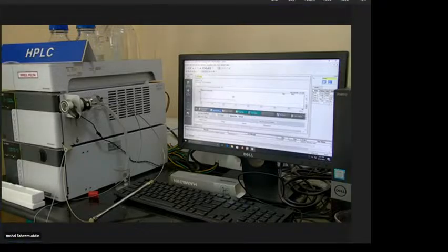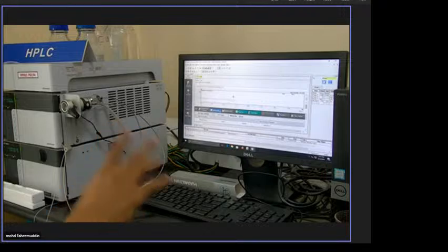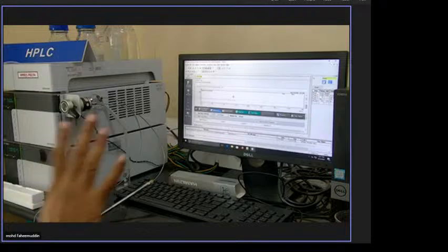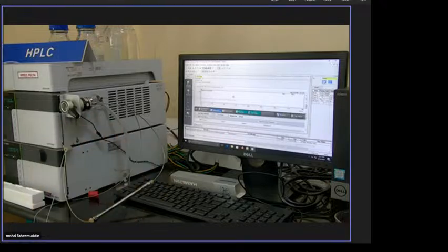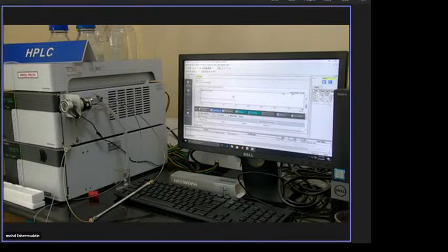After completion of that, you are able to handle the instrument from switching on to taking the spectra, sample preparation, everything. So you are alone sitting here and handling the instrument. That is actually the objective of that program. We are going to start this week or maybe next week, exclusively for 10 students. It's not possible to handle more than 10 students at a time.